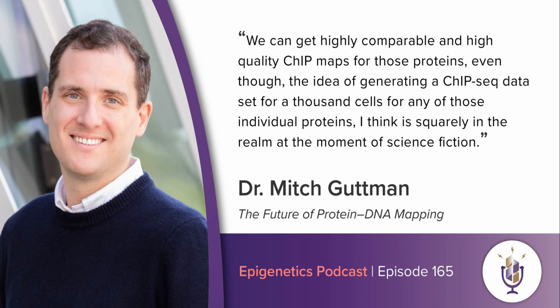I guess the only additional point I would make, and I sort of alluded to this earlier, is that I think about ChIP-dip as one piece of a larger puzzle, a larger toolkit for multi-omic data integration, and basically of democratizing data integration across many protein types, DNA localization, and also 3D mapping, single cell.